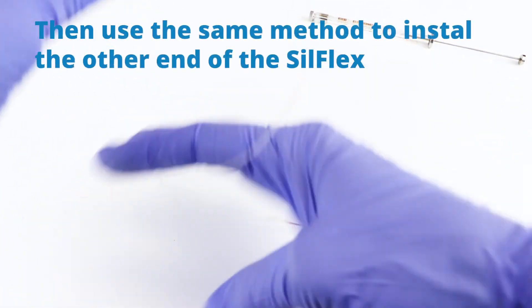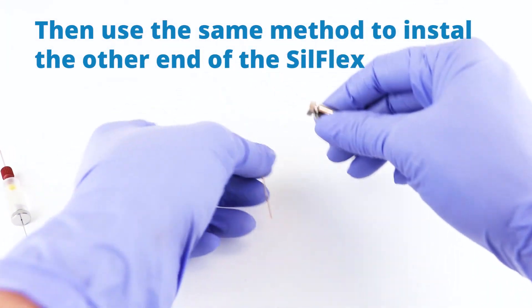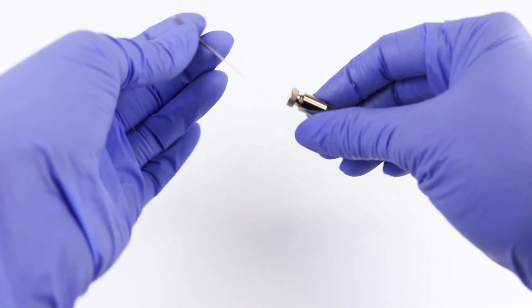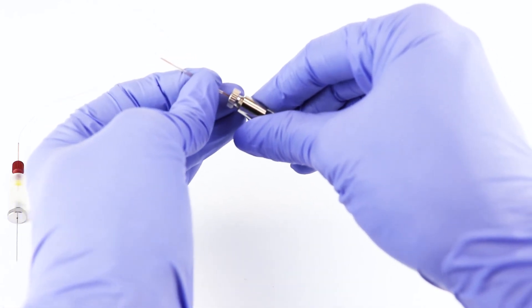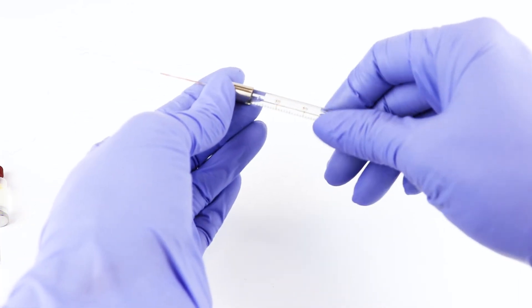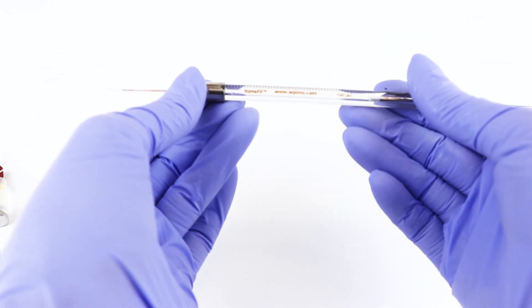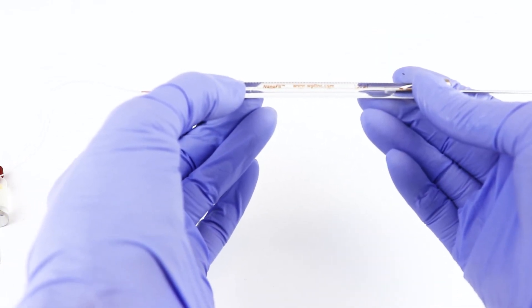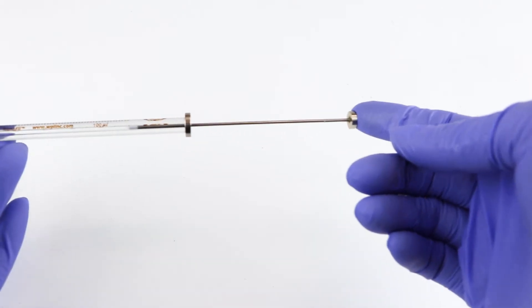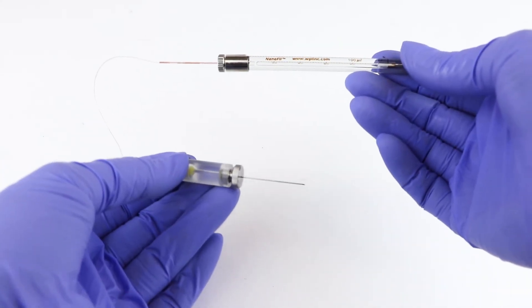Then we're going to use the same method to install the other end of the Silflex in the syringe. Loosen that up and put it in here. You want it to go right to the zero mark, but not beyond — if you push it beyond the zero mark and depress the plunger, then you can't get it all the way down to zero. Then you have your RPE or your IO kit set up.